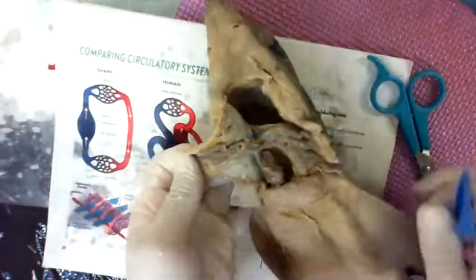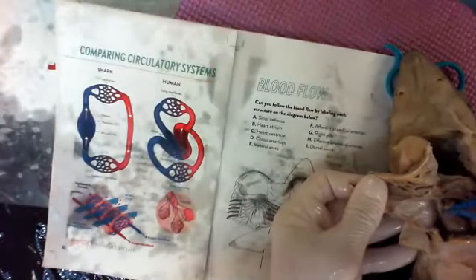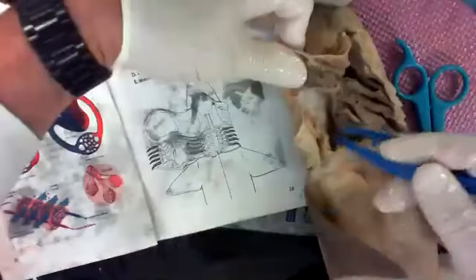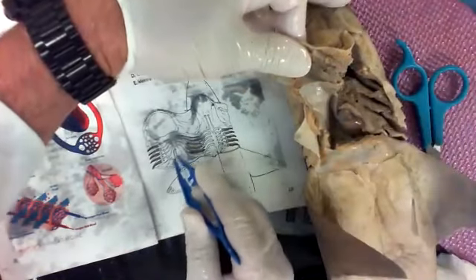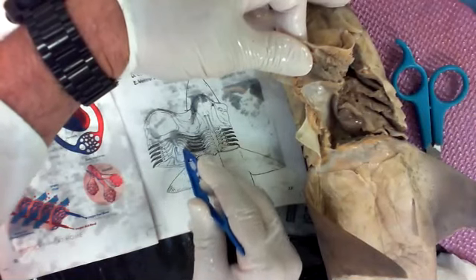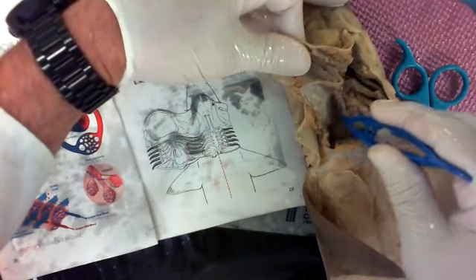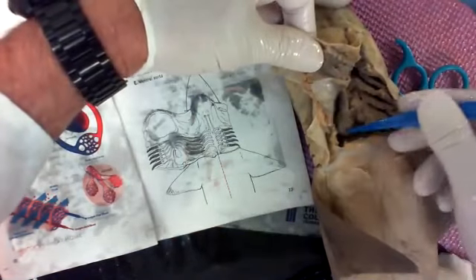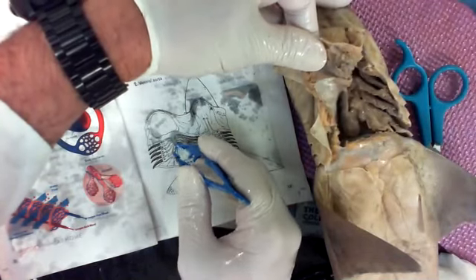But if we look at the blood, this is kind of cool how it works. Let me get this all out of view. When the heart squeezes, here's the, whoops, sorry. I'm trying to show the pictures here at the same time. When the heart squeezes, there's the ventricle that's doing the pumping. It's going to push out. You're going to see, here's the heart. There's the conus arteriosus, the cone-shaped structure. You can kind of see the outline of it right here. The conus comes out. And there's your ventral aorta that goes up, carrying what? Oxygen rich or oxygen poor?